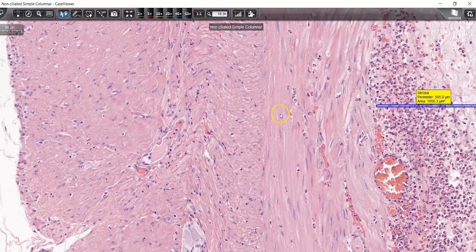There are two patterns of smooth muscle fibers in this layer, the circular pattern and also the longitudinal pattern. As we can see here, at this layer of smooth muscle fibers, we can see the spindle-shaped appearance of the smooth muscle fibers.